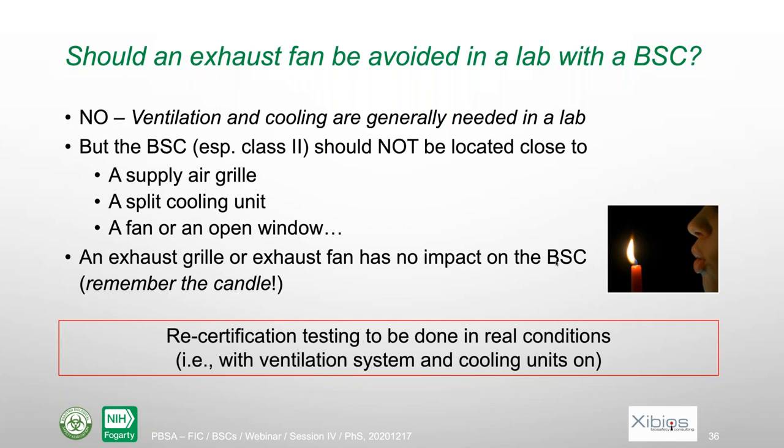The important thing there is that you need to do certification testing in real conditions. That means that if you have a split cooling unit or a ventilation system, the ventilation system or the cooling unit should be on when you test, when you check the biosafety cabinet.